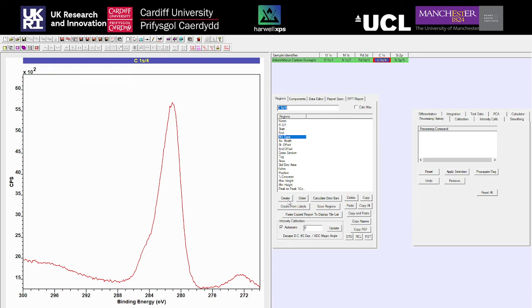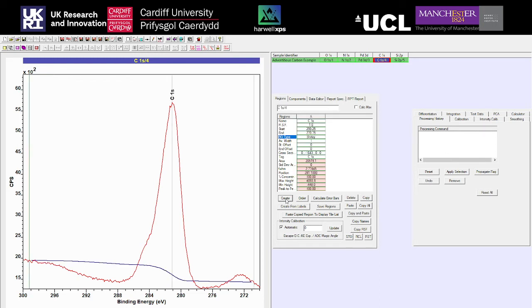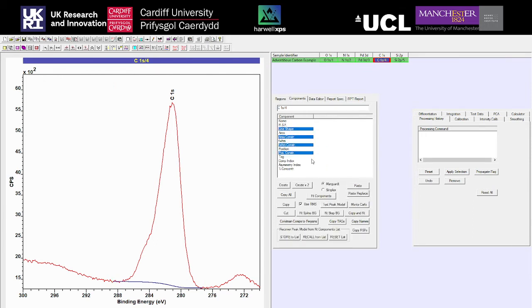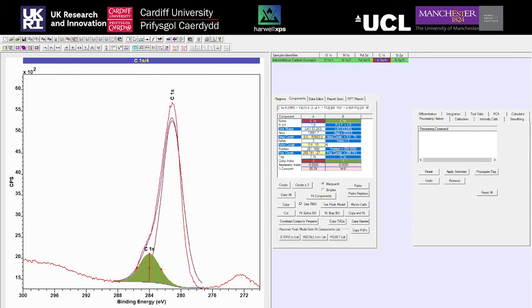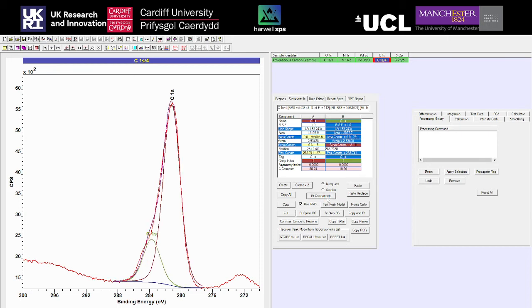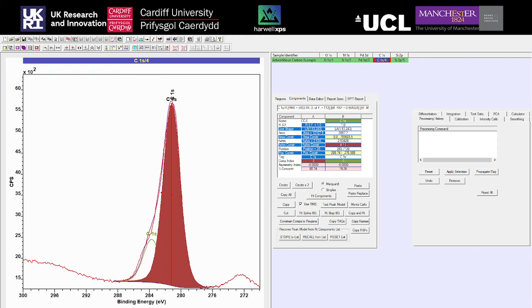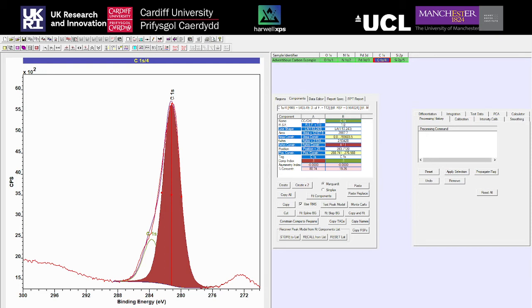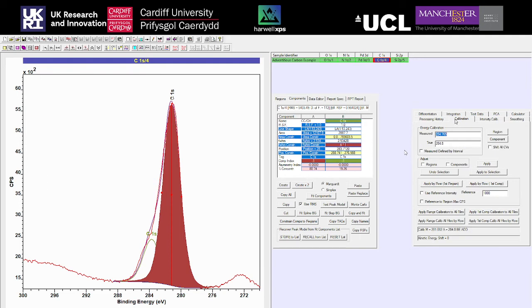Another popular way to calibrate is via the quantification panel. We'll go through regions and components in more detail in upcoming videos, so don't worry too much about following what I'm creating here - it's a very vague peak model, doesn't have to be perfect. I'm going to call the main peak C-C/C-H. Now if you've got a broad carbon region and want to calibrate specifically to the low binding energy carbon, you can put in your peak model.